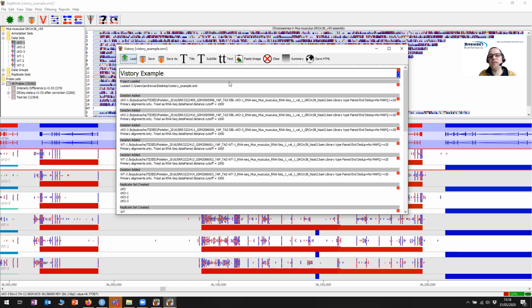I can only move things up or down that aren't automatically generated events. Because all of the rest of these have to occur in a particular order, it doesn't make any sense to be able to move them up or down. I can delete things. So if I've done a bunch of stuff that I don't want to record in the end, I decided it wasn't worth it, I can press the red X's to remove it. But only things that I've inserted myself, I'm allowed to move up or down inside here.